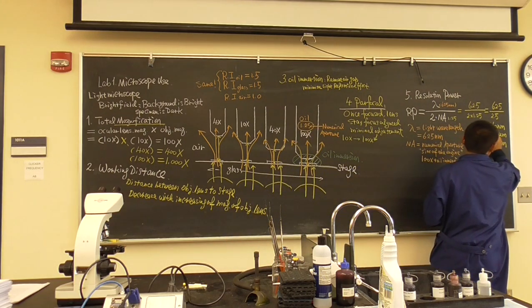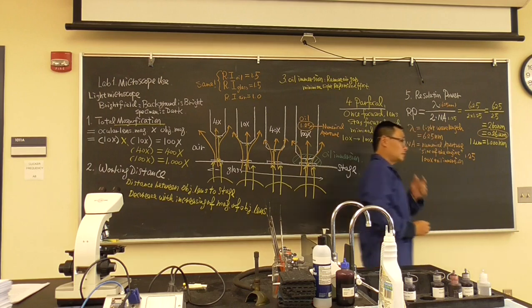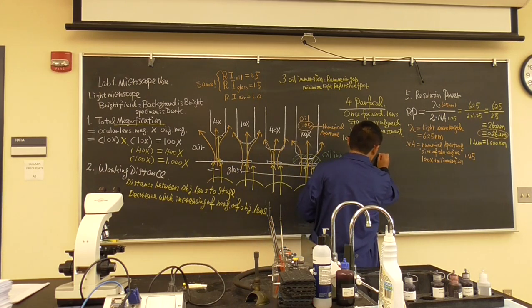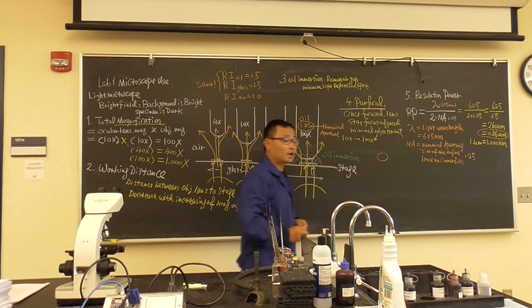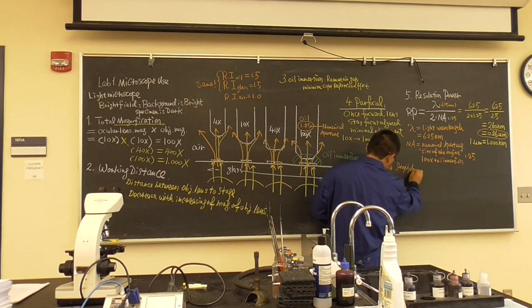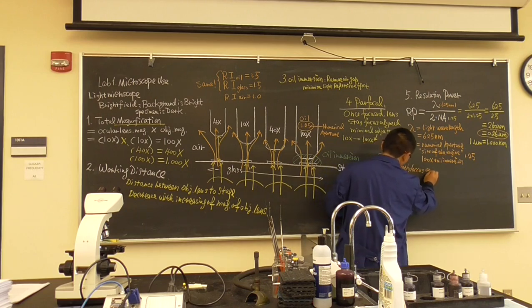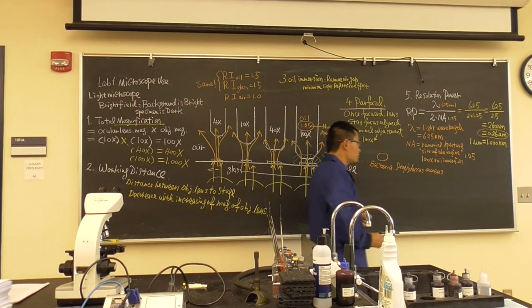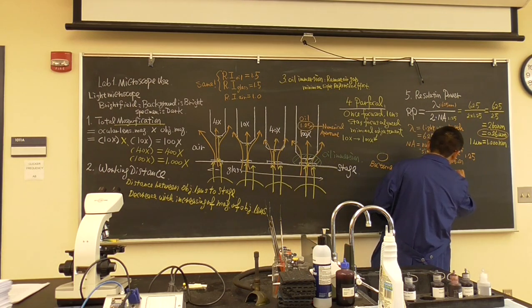I want to explain to you why. Can you guess the average size of a bacterium? How large is it? Let's say I have a bacterium which is Staphylococcus aureus. What is the size? It is very small, 0.5 micrometer.